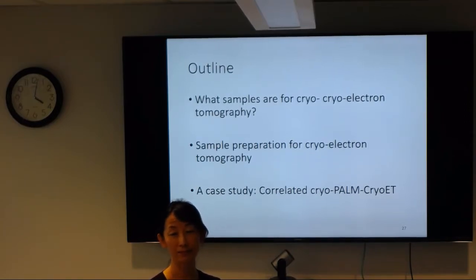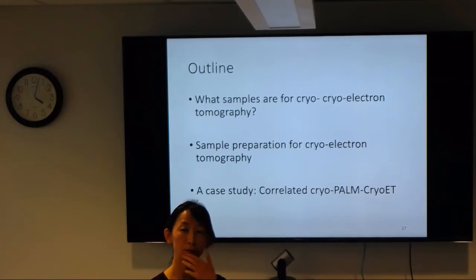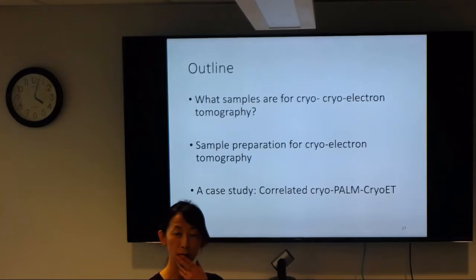Have you used silicon nitride grids at all in your lab? They make EM grids out of silicon nitride that are basically glass. They're a little hard to clip into autoloaders. They have giant windows in the center, and a continuous film that you can get down to five nanometers. It's silicon nitride, and you can etch the glass if you want. I use silicon dioxide. It really looks like just glass.